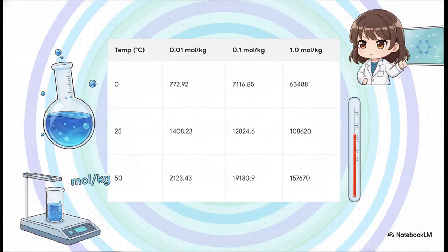And we have to be incredibly precise with that calibration standard. The NIST primary standard conductivity values for KCl are mapped out at very specific temperatures and concentrations. Notice that we use molality here, that's moles per kilogram of solvent, rather than molarity. We do that because it guarantees our concentration isn't artificially messed up by the thermal expansion of the liquid. Maintaining constant temperature control in the lab is absolutely paramount if you want a true assessment of your solution quality.